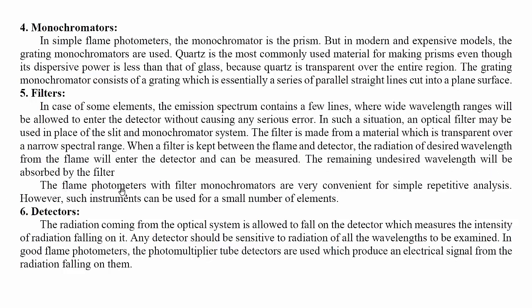The flame photometers with filter monochromators are very convenient for simple repetitive analysis. However, such instruments can be used for a small number of elements.